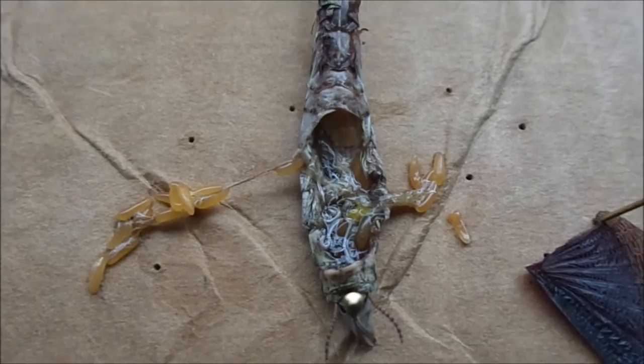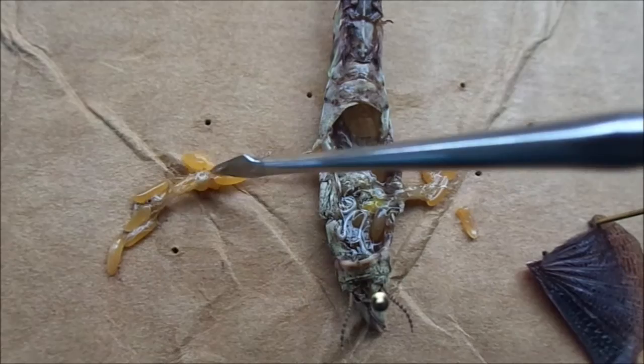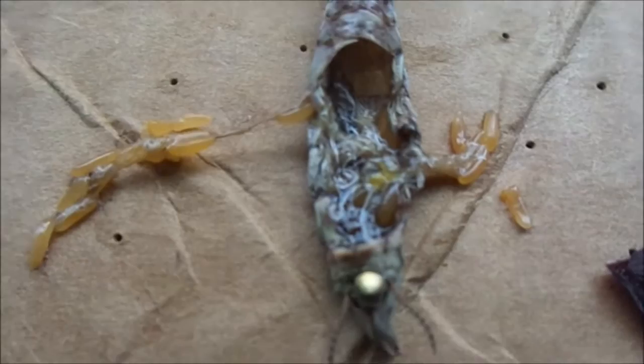Same mantis, opened up. You can see I've pulled out a lot of eggs here — these little oblong yellow things. This one has a lot less fat than the last mantis I dissected. You can only really see a little bit of it — this yellow stringy stuff. Down in there, you can see these two little white lines. I believe those are the kidneys, or at least some form of excretory system that deals with getting toxins out of the body — quite similar to what I've seen in a locust.